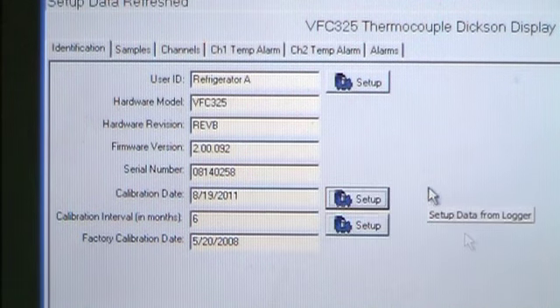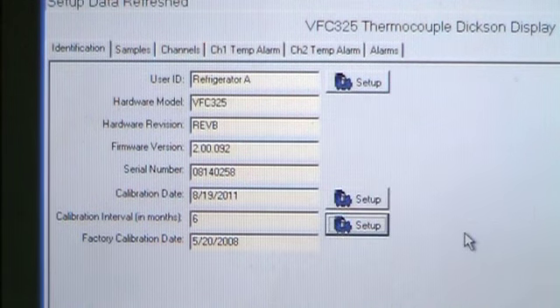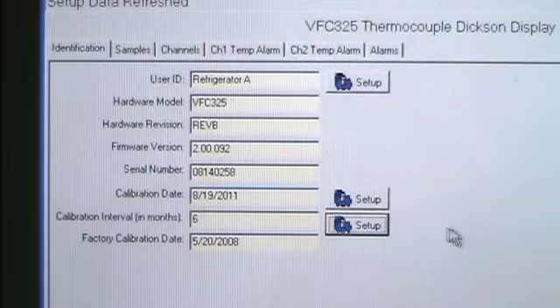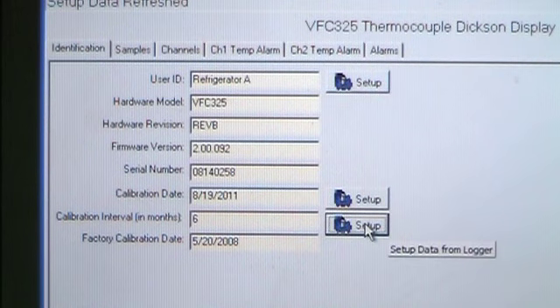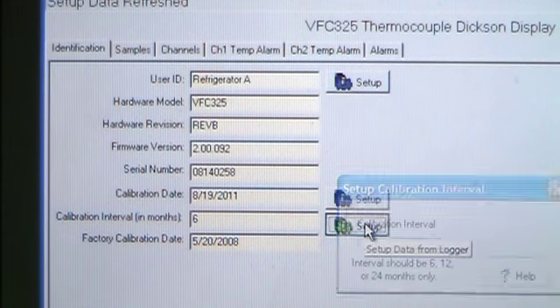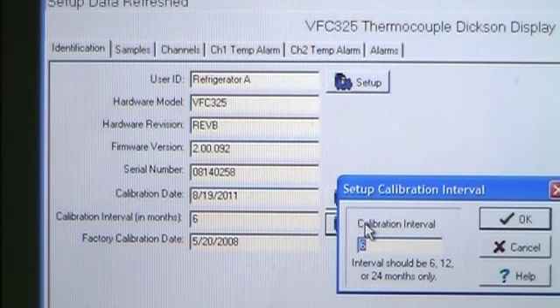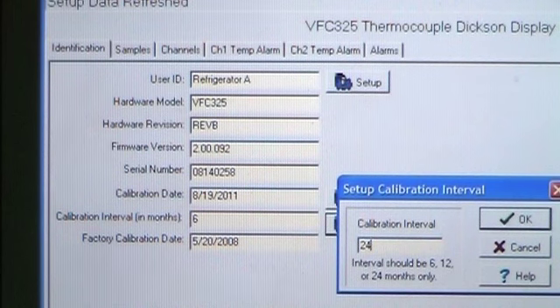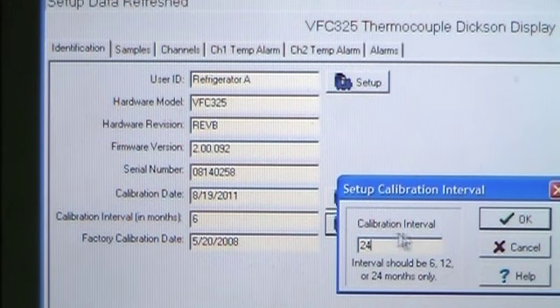Choose the Setup button for the calibration interval. Change it to 24 months, then click OK.